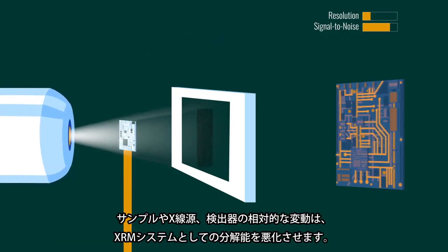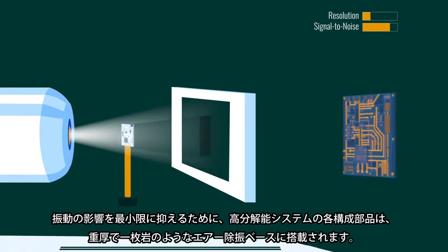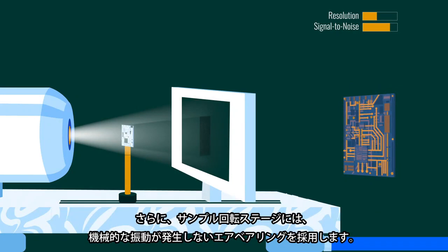Relative motion of the source, sample, and detector reduces the resolution of the system. This can come from environmental issues like vibration, or systematic issues like bearings in the sample rotation stage. In order to minimize the effects of vibration, the components in high-resolution systems are attached to a heavy, monolithic base that floats on air. Additionally, the sample rotates on an air isolation bearing.